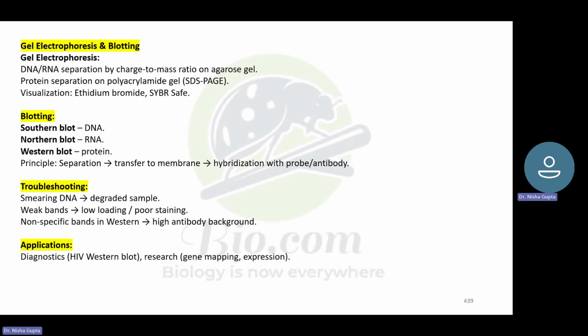So what do we do in gel electrophoresis? Gel electrophoresis is basically for the separation of DNA and RNA based on charge to mass ratio. Suppose this is your gel, this is the negative cathode and the positive one, and you have these wells here. Then the higher molecular weight will get stuck over here, and the lighter molecular weight will run more. यानी जो heavier रहता है वो slow run करता है, और जो lighter होगा वो migrate करता जाएगा. So this is how it is separated on the basis of charge to mass ratio, right?